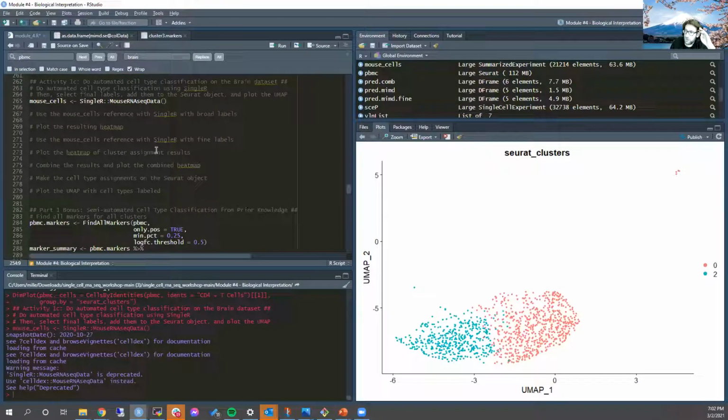I think it's a really great real world example of the kind of thing you'll actually be doing. And this is a very real world data set too, by the way. We'll talk in a minute about what happens when you've got an ambiguous cluster that seems to have issues with it. So go ahead, we'll regroup at 7:13. And again, if you've got to bounce, do feel free to do that. This will all be in the lecture later.